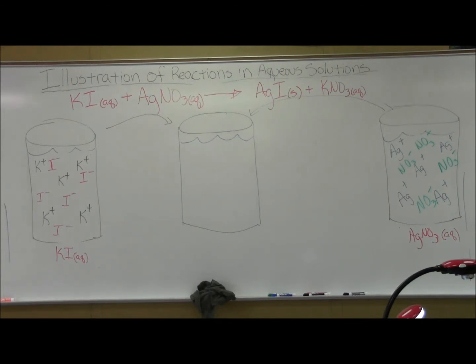So there was a definite precipitate. I will show the viewers at home. Oh my God, it's a precipitate. And what else? And a color change.